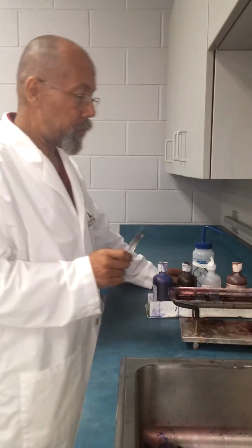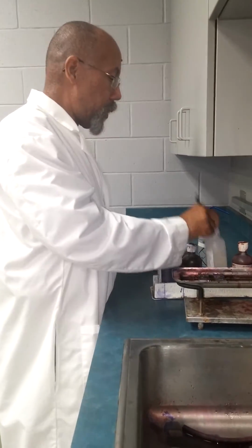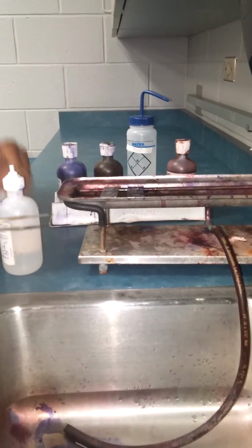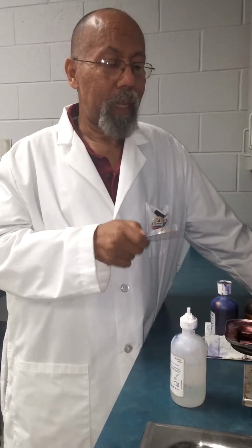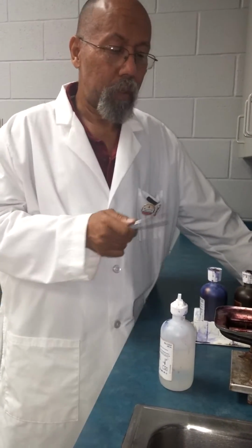The third step is to use the decolorizer. And we use acetone alcohol as our decolorizer. This is the critical step in performing the Gram stain. The decolorizer is going to remove the crystal violet from gram-negative organisms, whereas gram-positive organisms retain the crystal violet.